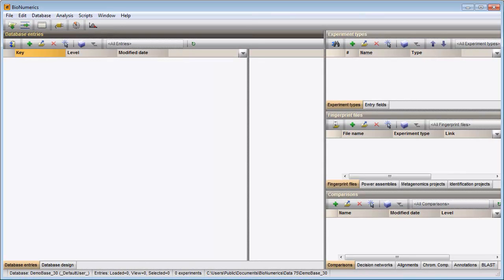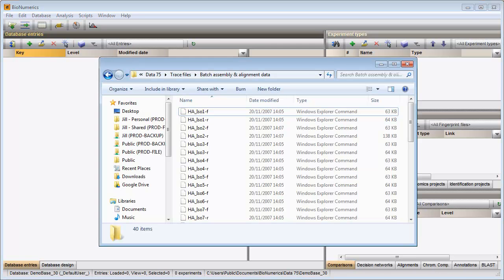In this video I will walk you through the import and assembly of a set of trace files. My dataset contains SCF trace files originating from influenza A virus strains.